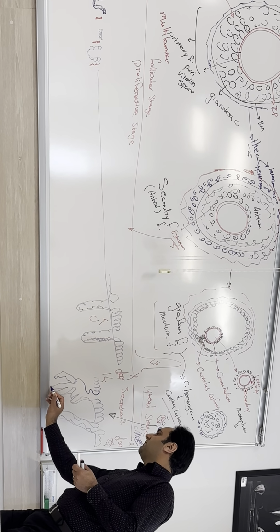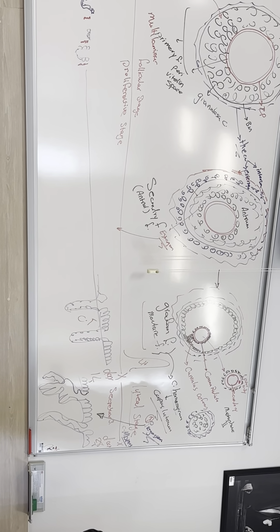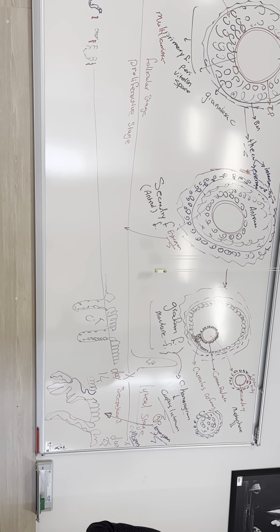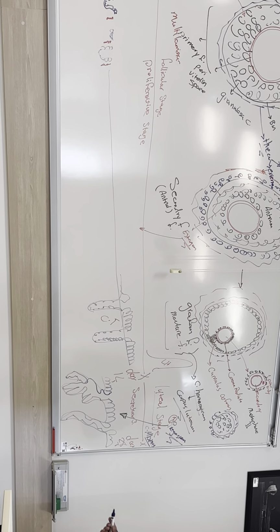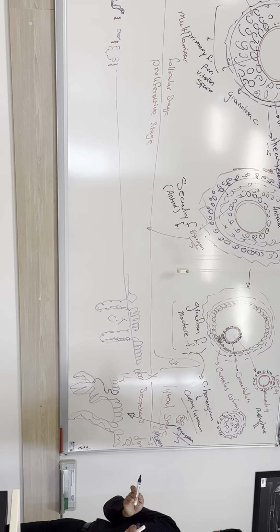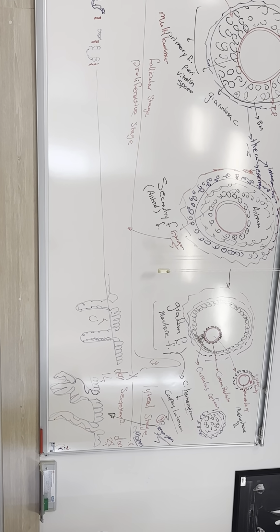With this change in the structure of glands, these glands now start to secrete glandular secretion by exocytosis into the luminal side of the endometrium.